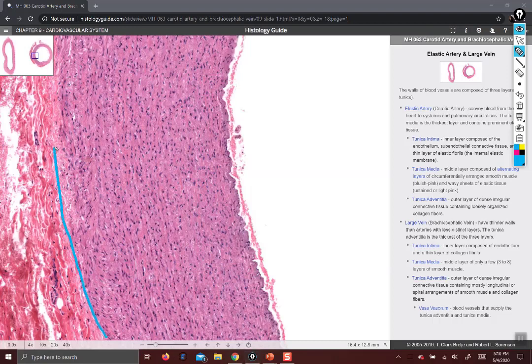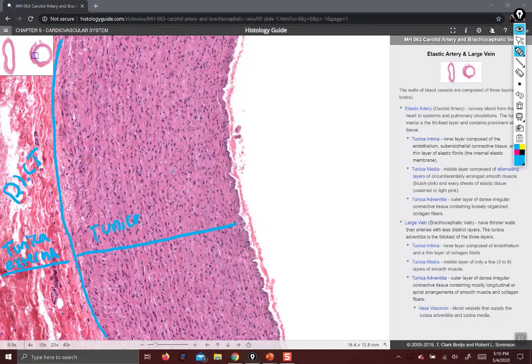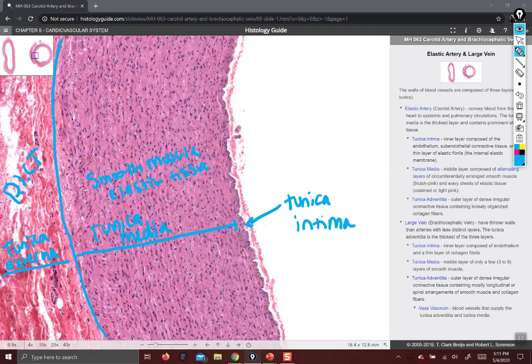You can see a very obvious transition from smooth muscle and elastic fibers to dense irregular connective tissue. This layer is the tunica externa, made of dense irregular connective tissue. So those are the layers of an artery: tunica intima — endothelium and elastic tissue — tunica media, and tunica externa.